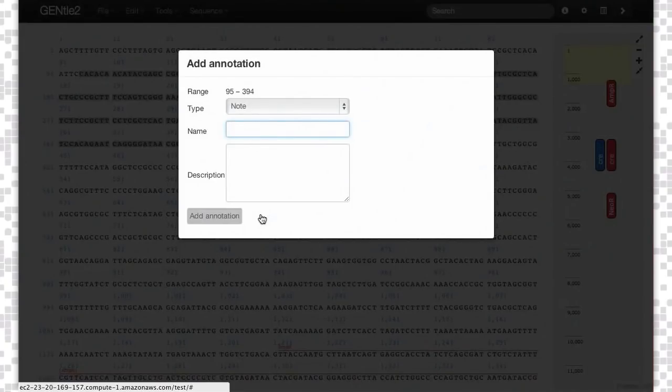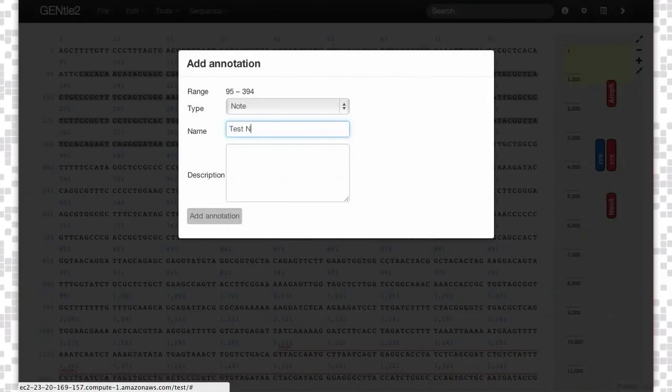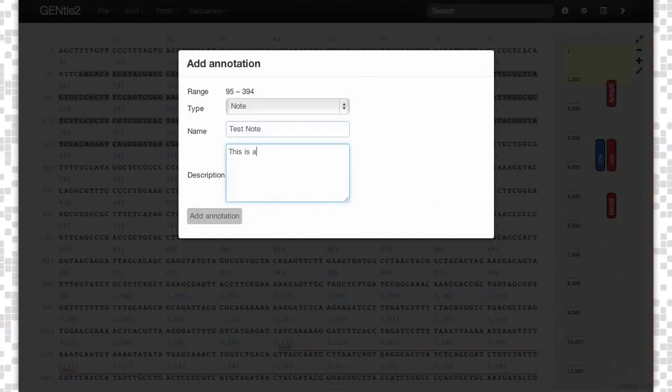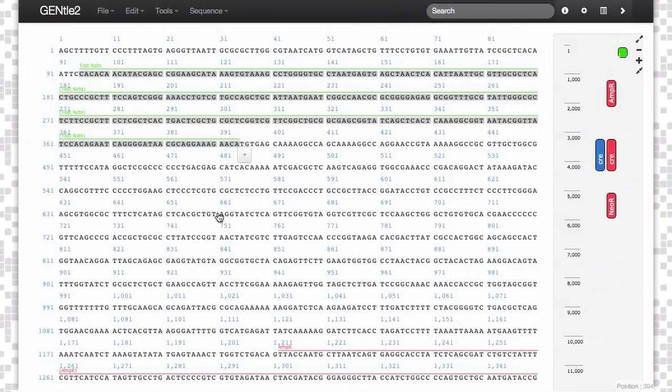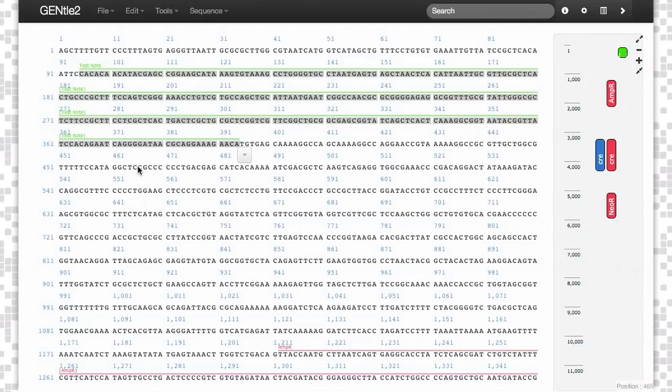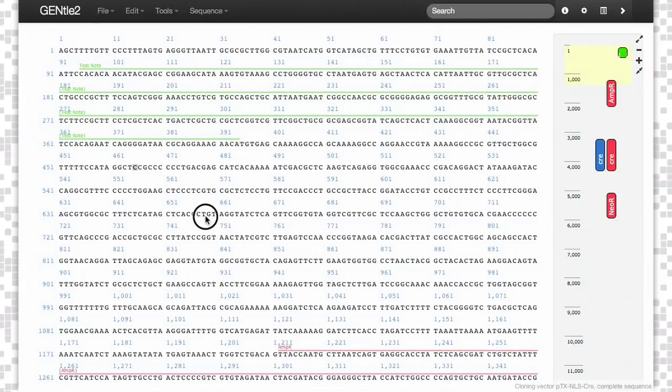In the case of a note, you can write the title of the note, and that adds your annotation. You can also annotate for a functional sequence by highlighting.